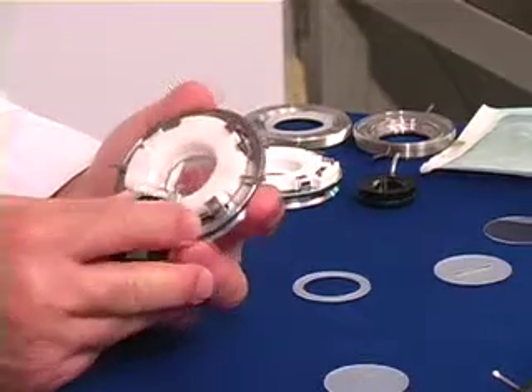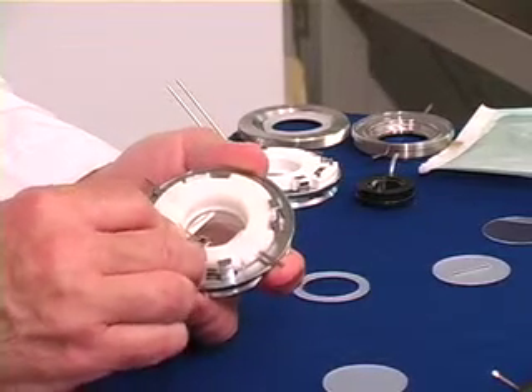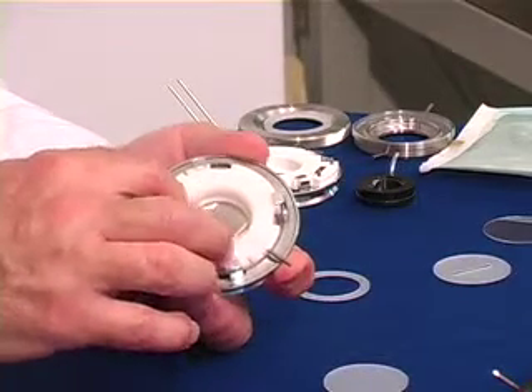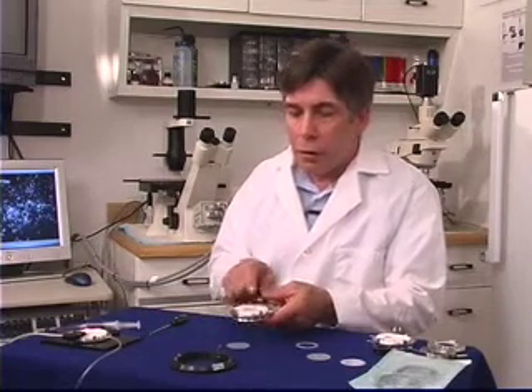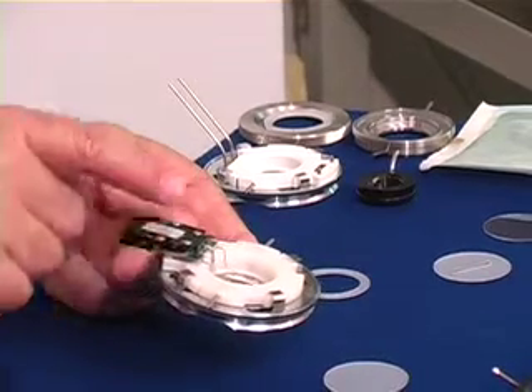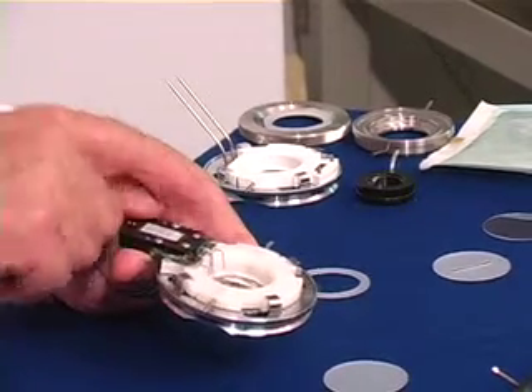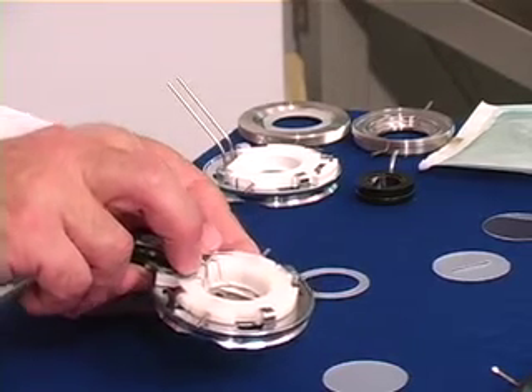The electrical connector reads the temperature of the base of the FCS-2, reads the temperature of the microaqueduct slide, and applies electrical current to the top surface of the microaqueduct slide. This allows a very uniform temperature distribution across the flow cell. As you change perfusion through the chamber, the microaqueduct slide can re-equilibrate the temperature through the middle of the field, avoiding the typical temperature gradients that occur with a peripheral heated system.